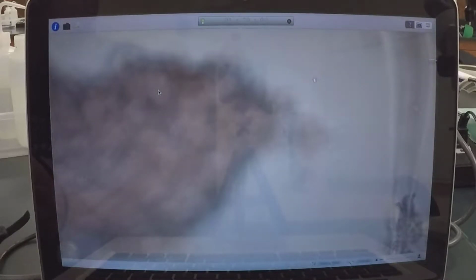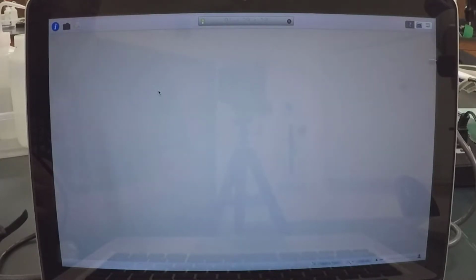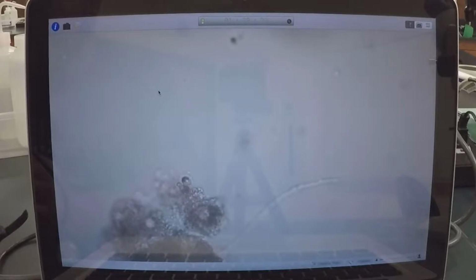Okay, there's a different example of diversity here in this pond. Occasionally you're going to see some things that are hanging off of algae, stentors, or different species of stentors, and sometimes you'll see them moving, other times they'll just be hanging there. Okay, so that's a typical pond sample.